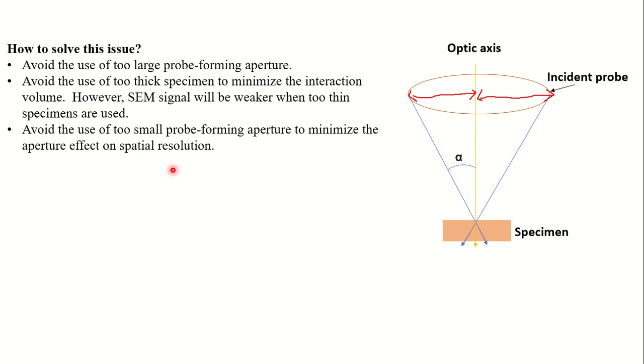So how can we resolve this situation? Avoid using too large a probe forming aperture to minimize the interaction volume. The entire motive is to reduce the interaction volume.